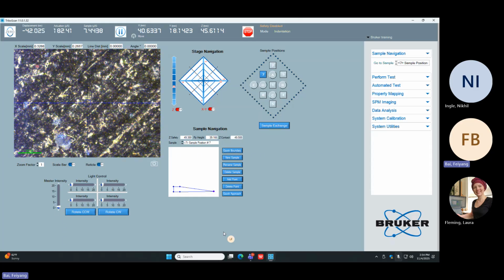Yes, so it's like a combination. It's more of an expansion, right? You can make it larger. You don't need to, but it can be a useful tool if you're struggling with the focal point. Yes, I agree. Good. I'm just going to delete this sample. That was mostly for the sake of the training. And let's go ahead and focus on the fused quartz standard once more. I'll let you drive now that I've demonstrated.